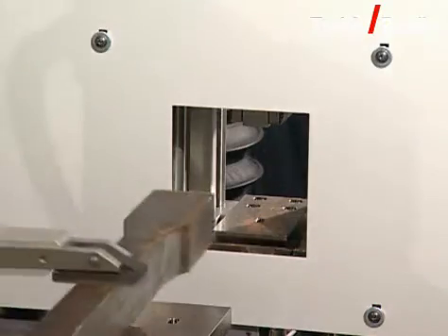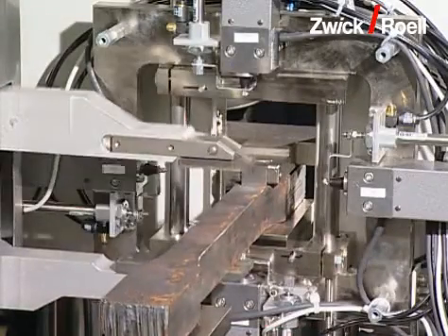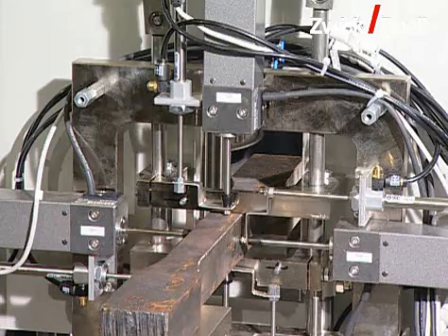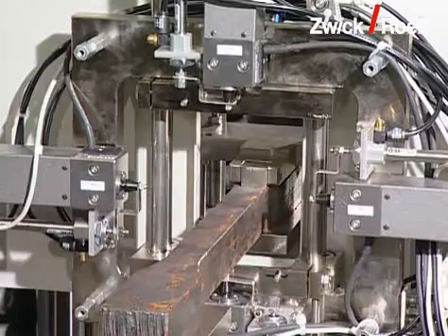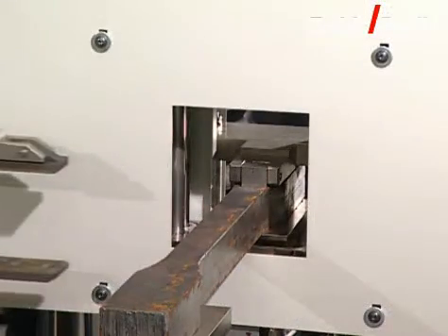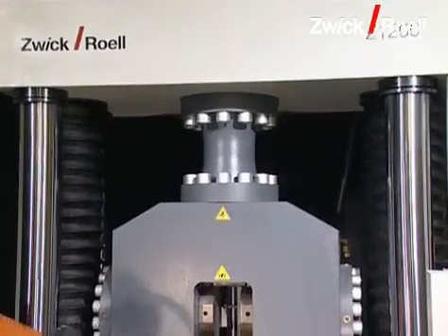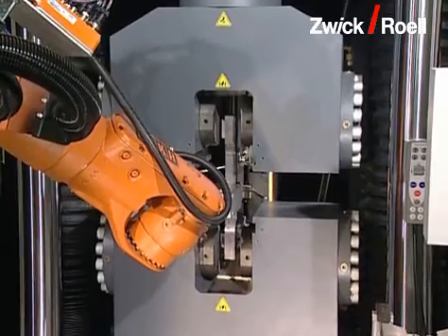Then it is transported onto the cross section measuring unit, where four measurement transducers measure the exact thickness and width of the specimen. Then the specimen is transported onto the testing machine for the tensile test — according to the specifications, this means the 1200 kilonewton testing machine 1 in this case.